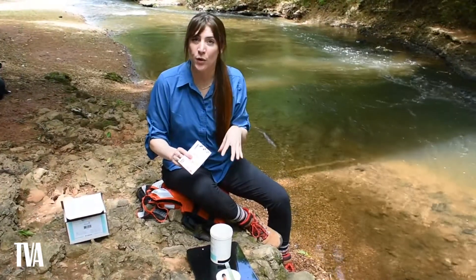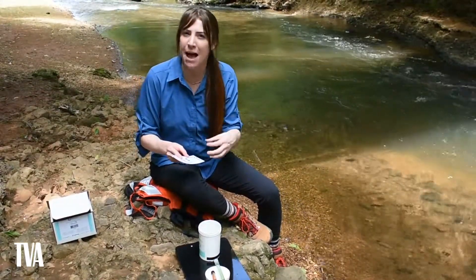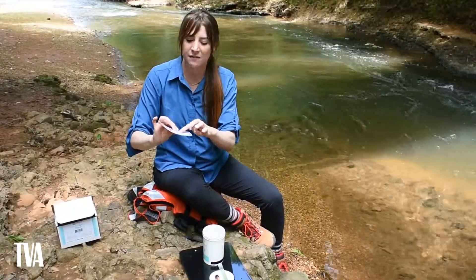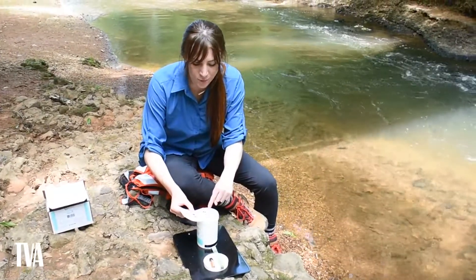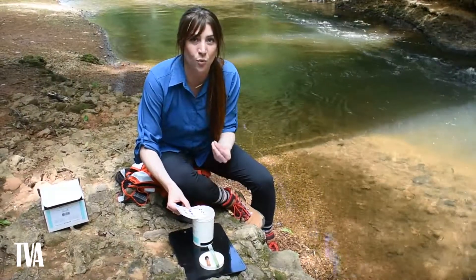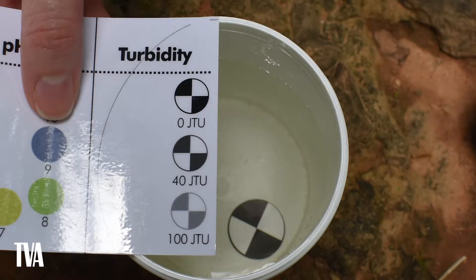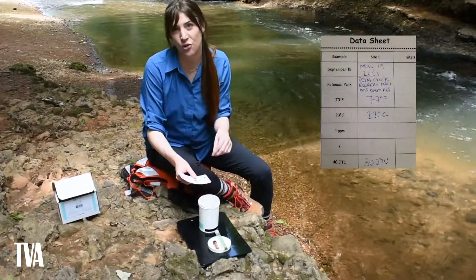The last test is turbidity — how clear the water is, or how much suspended matter it contains. Take your comparison card, find the half circle line, and line it up with the edge of your beaker. Look down at the Secchi disc and determine whether the turbidity looks closest to zero JTU, 40 JTU, or 100 JTU. It may not match exactly, so draw a conclusion about where it falls in that range. Once decided, mark it on your data sheet and add JTU next to it.